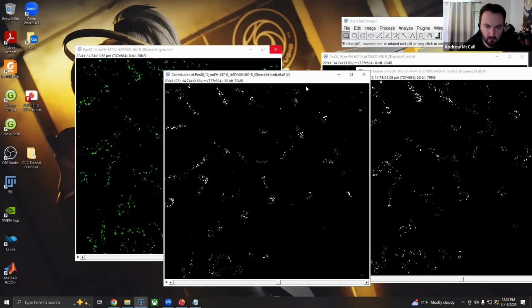Oh, is the correlogram also comparing the colocalization with a random distribution of the same proteins in the same area or volume? No, it's not. So you're talking about the Costes. It is not doing that. That is something I thought about implementing. That's kind of where the confidence effectively came from, was me trying to do a simplified version of that.